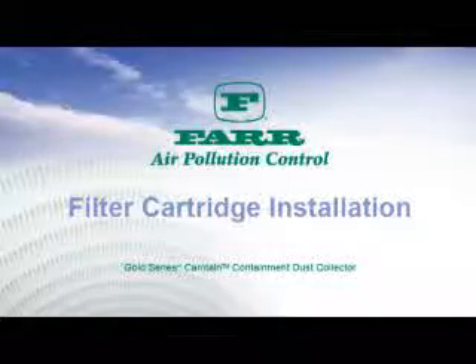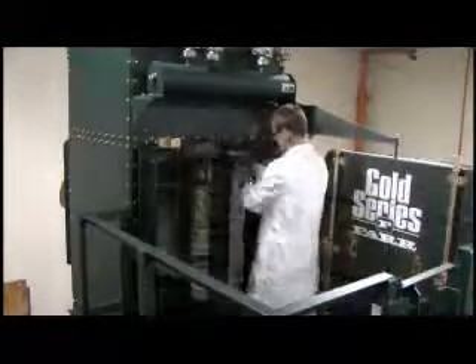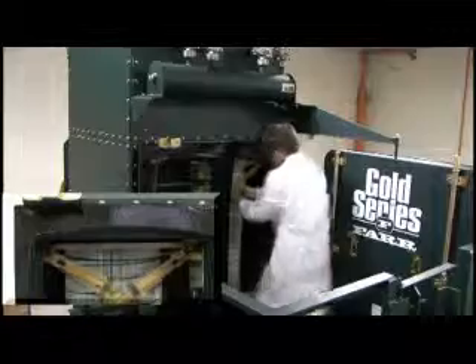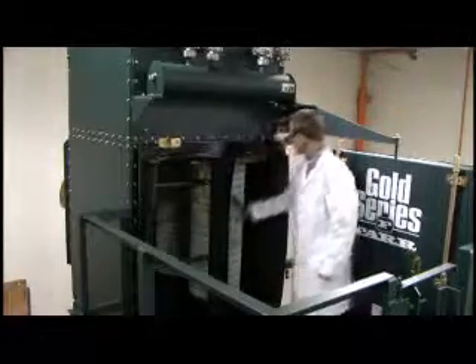Filter cartridge installation. Lift both of the cam bar handles towards each other, overlapping the right side over the left and locking into place via the corresponding securing tabs on the bar handles.